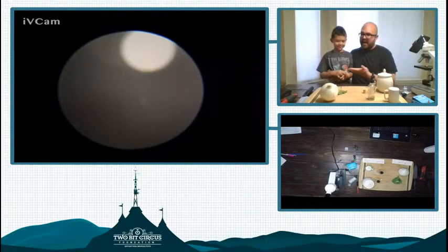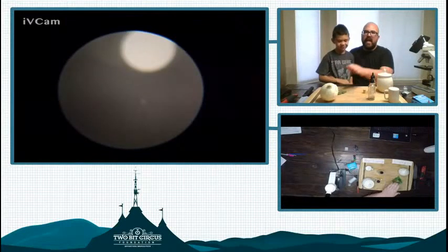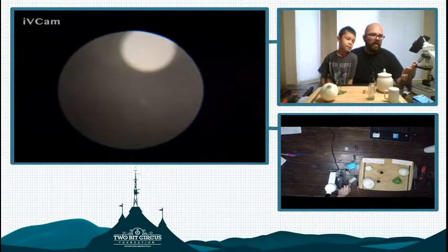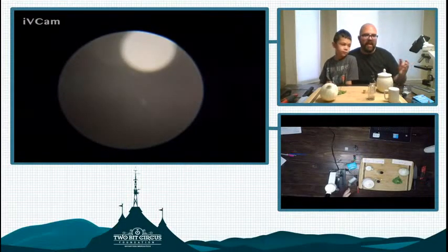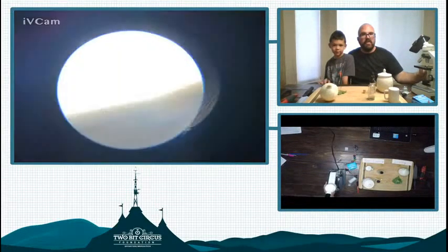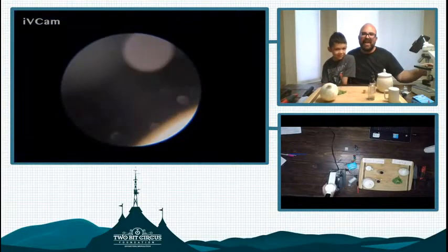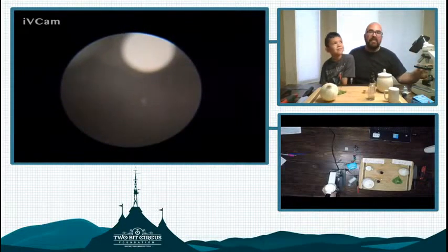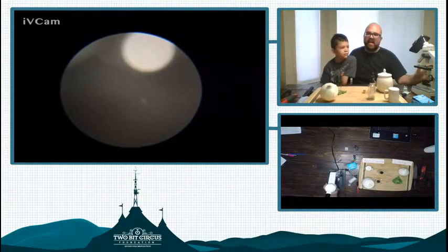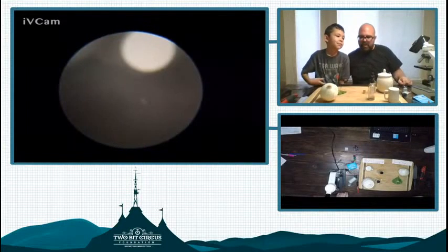Awesome, so you'll be able to see us, Robert and I. You'll be able to see our tabletop over here on the side. And this one over here, the big picture, is an image of the microscope. Right now there is no slide under there, so you're just looking at the diffused light coming through the hole. I have the light on here. My assistant off camera was saying that it might be the light from there, which is true too. If I were to turn off the light, you could use just ambient light to see what's on the slides. So this is our setup today, so we could do our experiment.